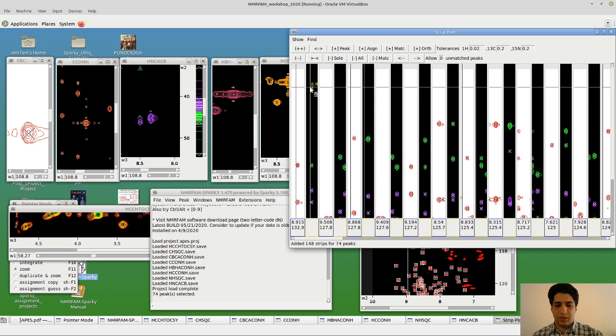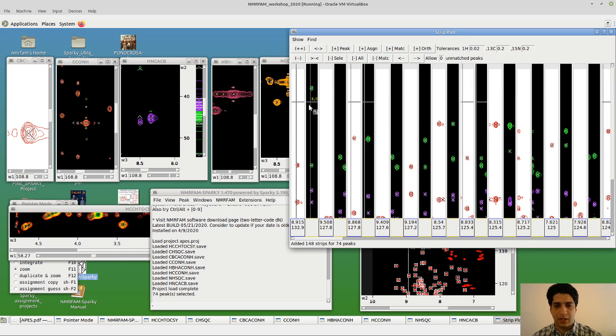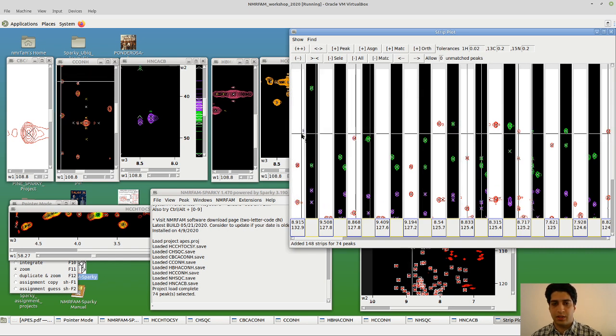The only exception is for glycine. So let's just move on here. So let's see. These two are fine. So we don't need to do anything here.